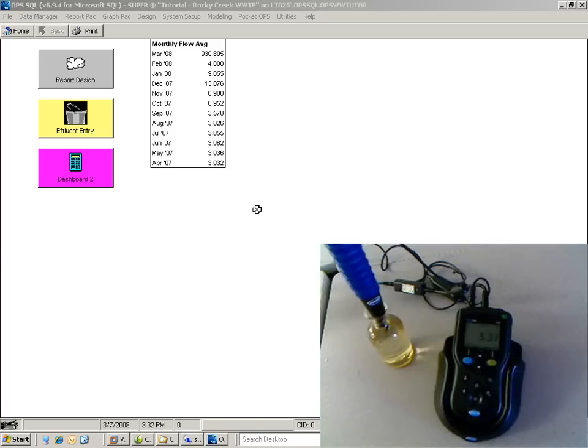I'm going to be taking you through how to use our BOD Manager with the Hach HQ40d portable instrument and the Hach LBOD meter. The meter is a luminescent meter, which means that there are no membranes to ever change. It uses light, and for people that are challenged with their ability to change membranes, like me, this can save us considerable time and effort.